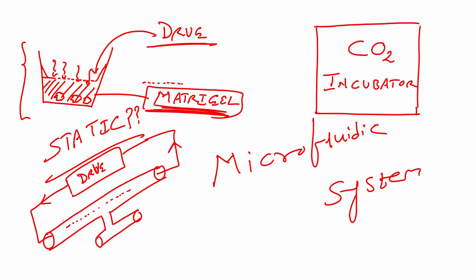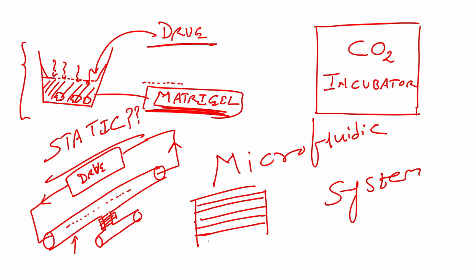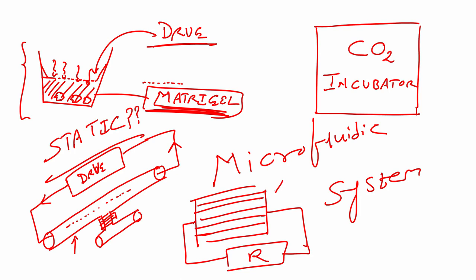Now, this is your channel. Here, I have inter-digitated electrodes. What is inter-digitated electrodes? When you take a metal and you pattern the metal, okay. I'll teach you how to do this one. This becomes our inter-digitated electrodes, and you can measure resistance. So, these are all metal lines, okay.